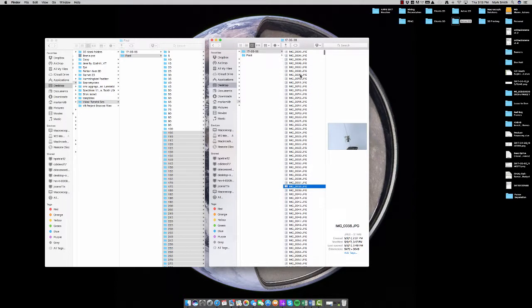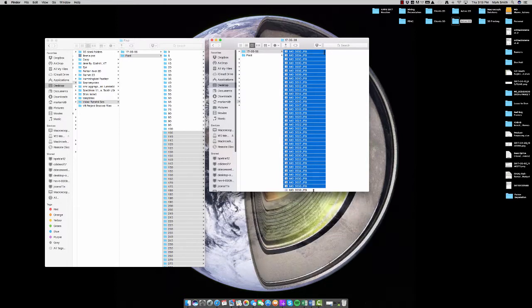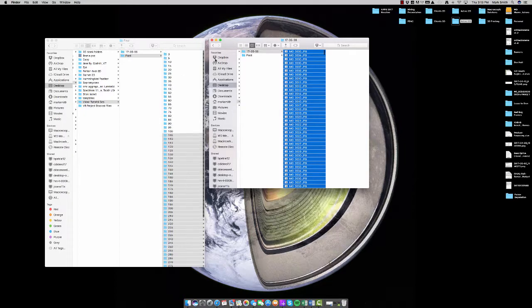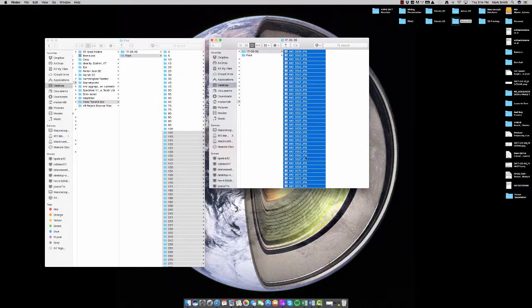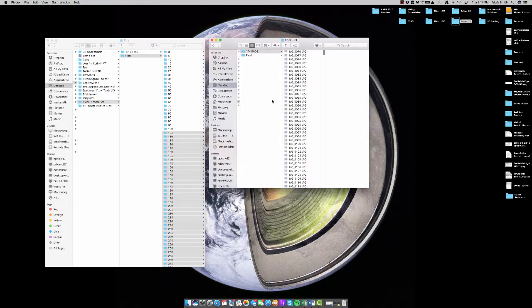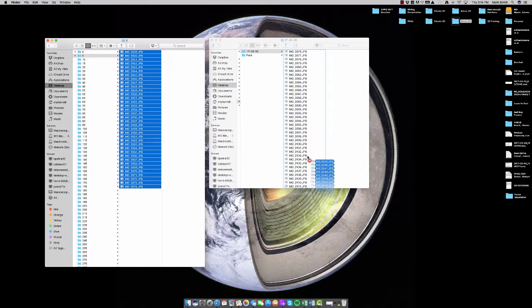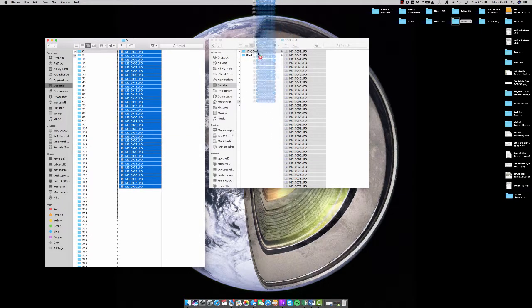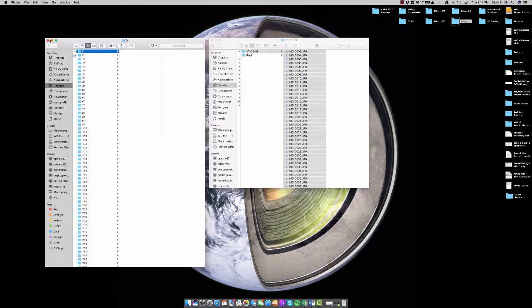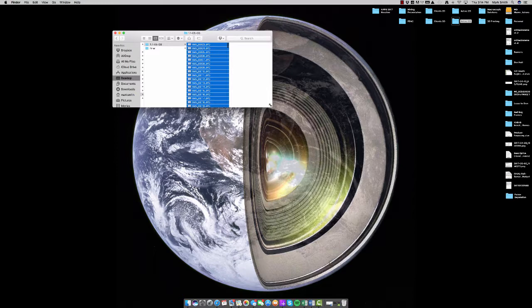So what you want to start doing is taking these photographs, taking the window right up to the bottom of that 36, and dragging and dropping into separate folders. So 0, then highlight these. We know that this is 36 images again, so we'll just keep doing that to 5, and so forth. Now that's one method of doing it. It's time consuming, and it's not the method that we recommend. So I'd like to put those images back in the folder and show you a much faster way to do this. I'm going to close that window, and what we're going to do is use terminal.